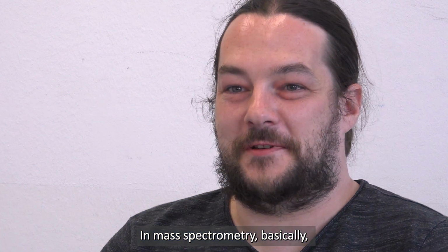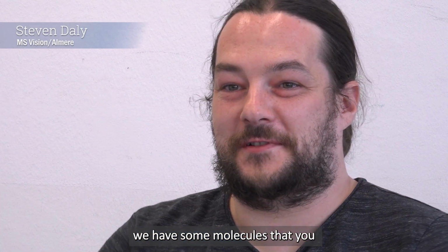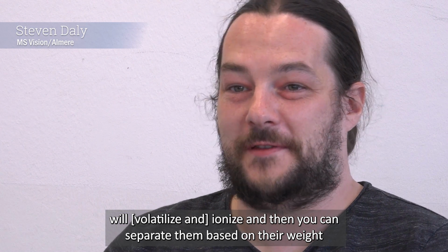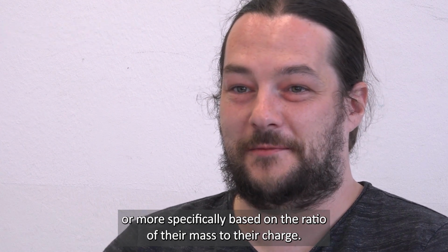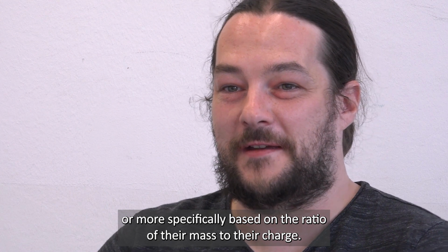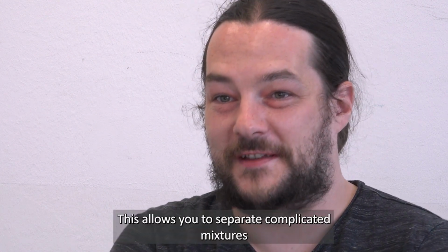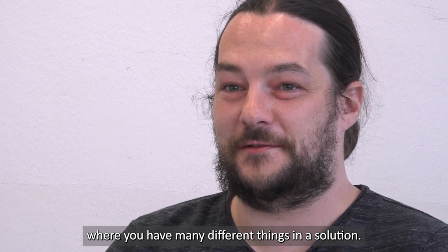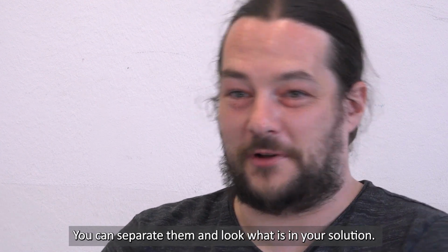So mass spectrometry, basically you have some molecules in a solution. You ionize them and then you can separate them based on their weight, or more specifically, based on the ratio of their mass to their charge. This allows you to separate complicated mixtures where you have many different things in a solution. You can separate them and look at what is in your solution.